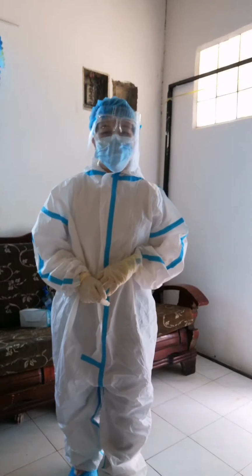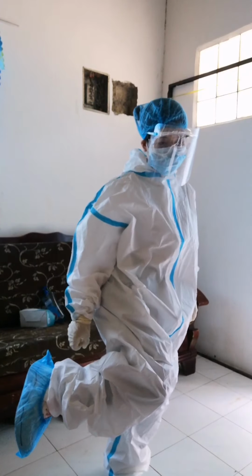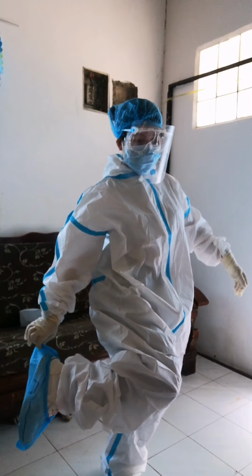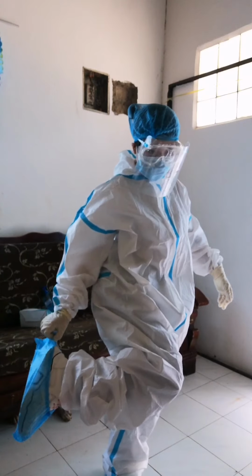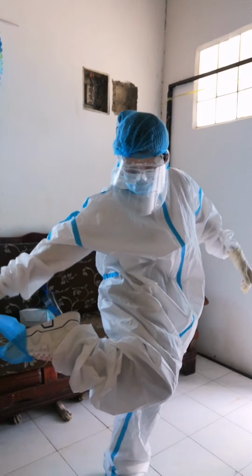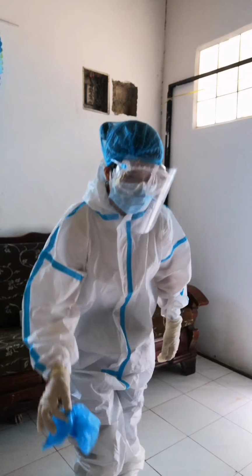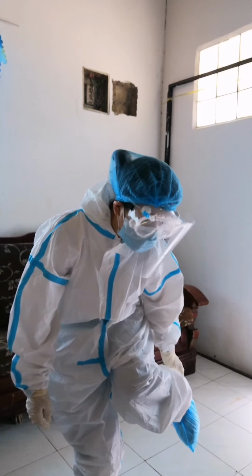So when doffing our PPE, the first procedure is to doff our shoe cover. We must grasp the outside of the shoe cover and pull it down our ankle like this. And we must dispose of it properly. Pulling away prevents contamination from soil and dirt.